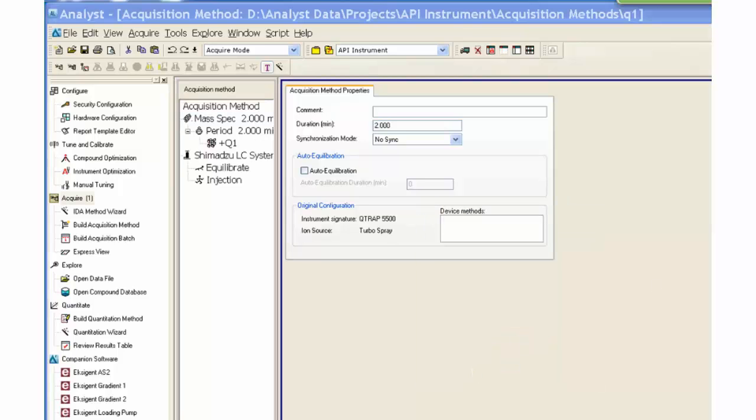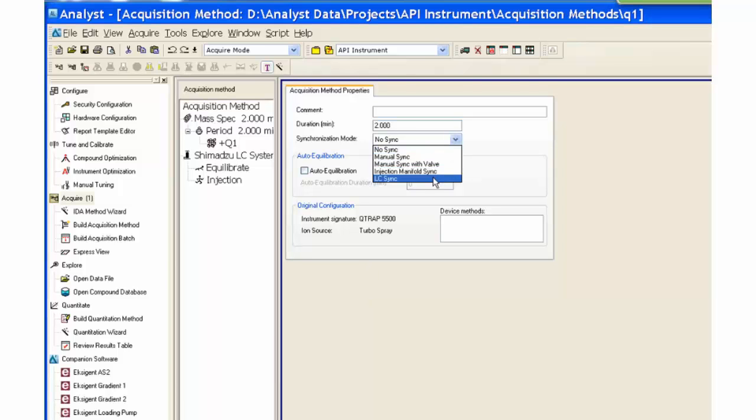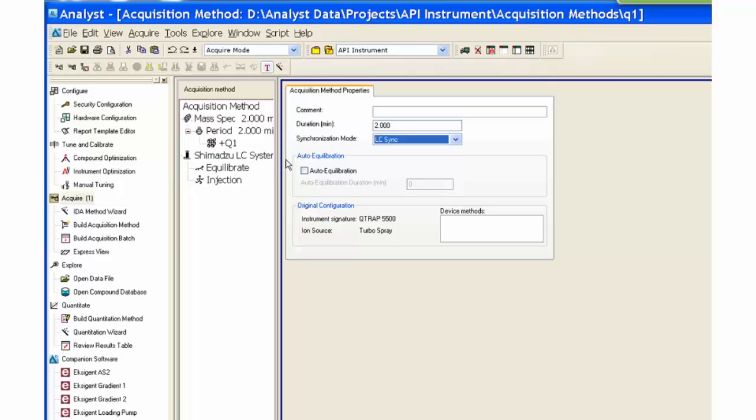Select LC Sync for the synchronization mode. This coordinates the LC auto sampler with the mass spectrometer and ensures that the mass spec starts scanning after the auto sampler has injected each sample.